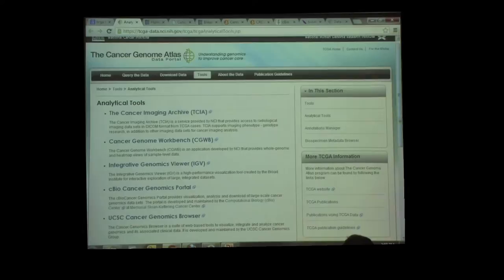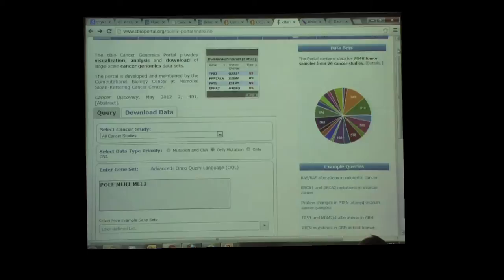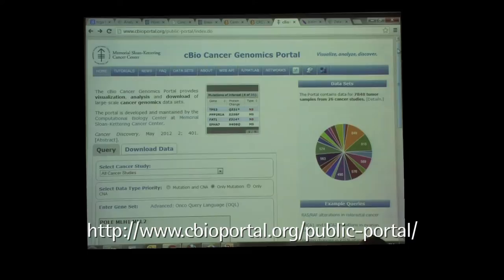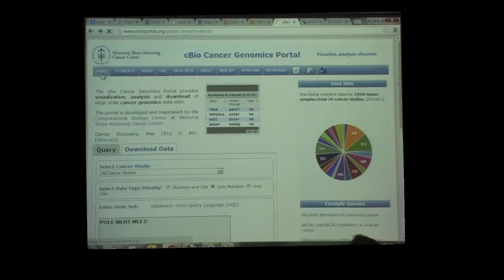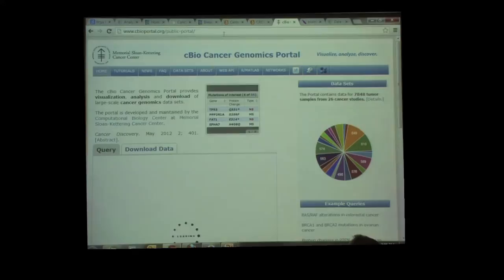Let me start with the cBio portal. This is a tool called cBio produced by Memorial Sloan Kettering, and I think this is an amazing portal. What this portal does is take all the data and distill it down into simple summary results. My workshop is about this tool too. Here's the page to go to it: cbioportal.org. For those of you who have laptops, you can follow along with me.